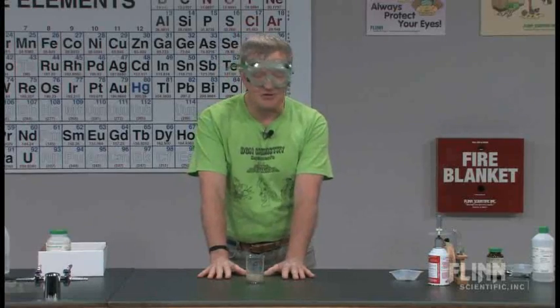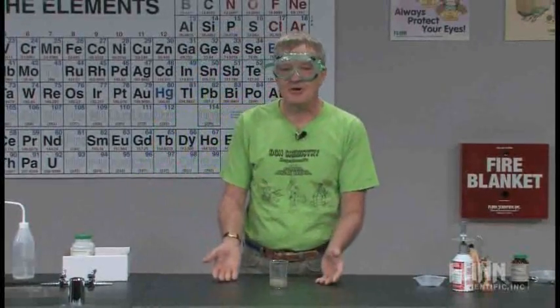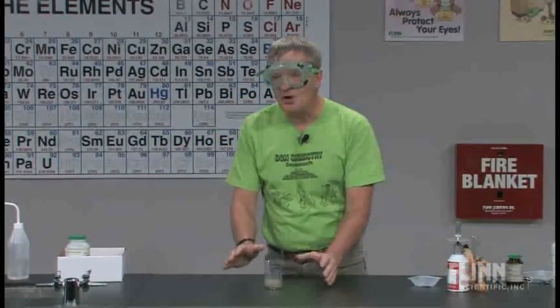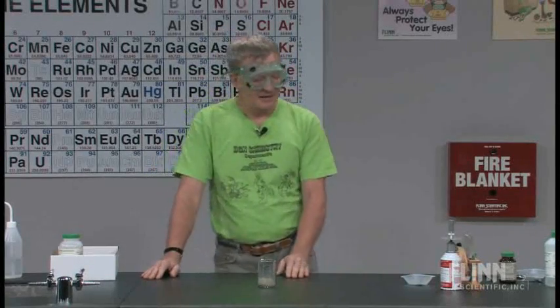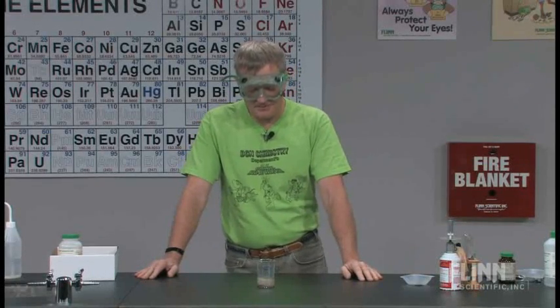This is truly a cool demonstration. It's a cool series of reactions. It's something you need to do because the chemistry is just so elegant and so much fun. The story, that's up to you. But the rest of it is just so much fun and so neat. There are so many things you can do with it, and it has so many great applications that it is, for me, my favorite demonstration of all the ones I've done in 30-some years of teaching. Thank you.